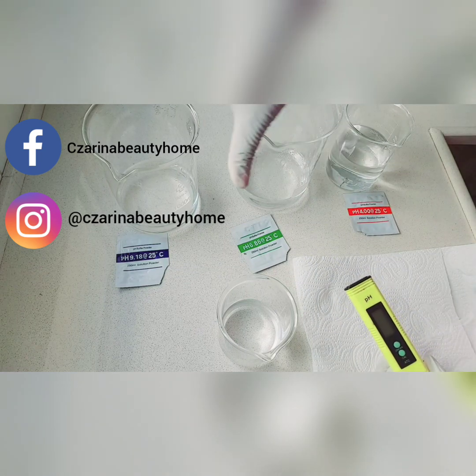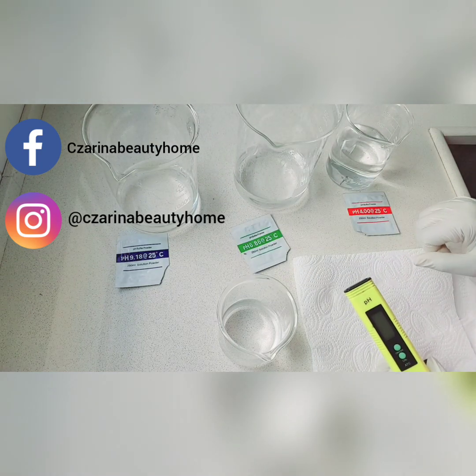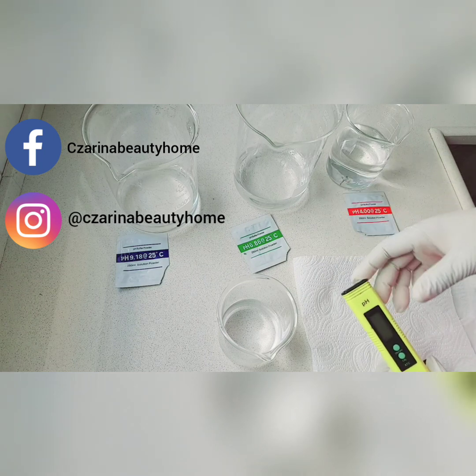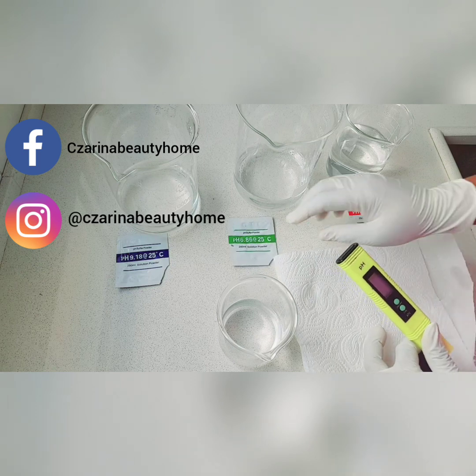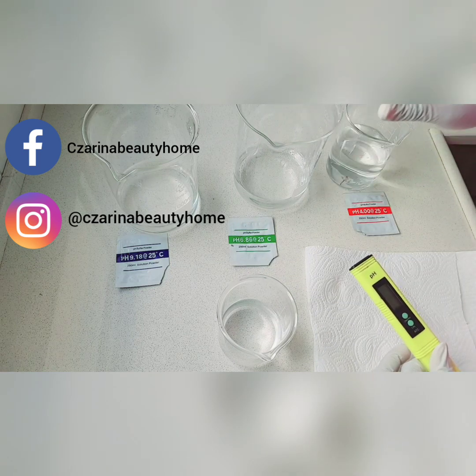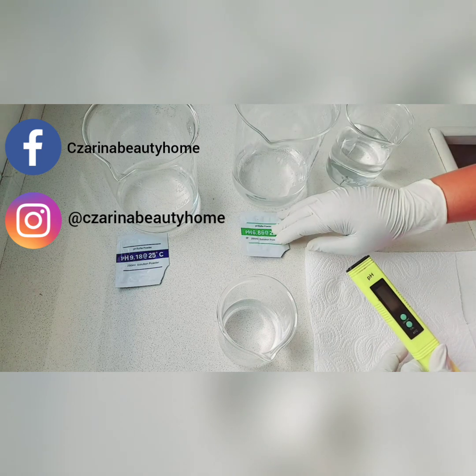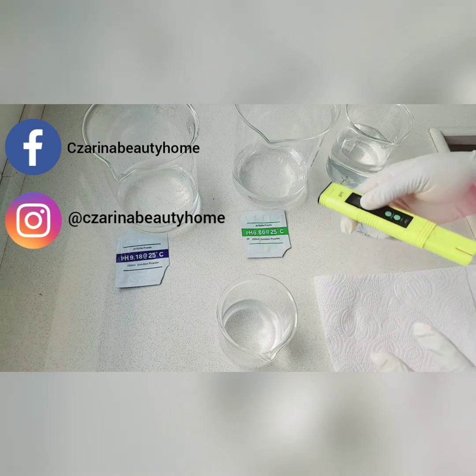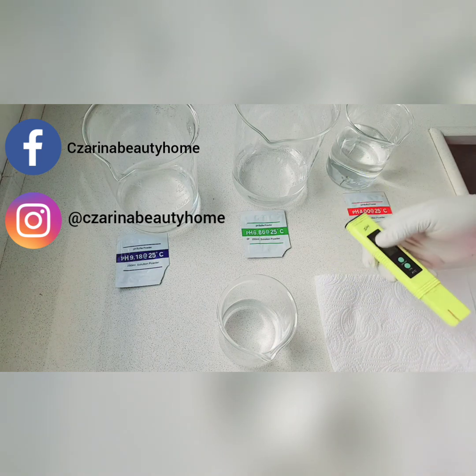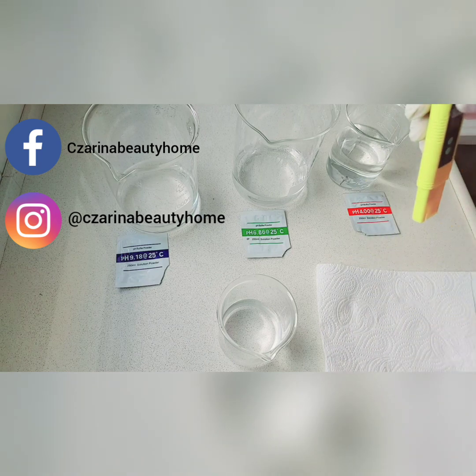I have three buffer solutions here, and you'll be needing 250 ml each for the buffer powders. You need 250 ml — don't go below that. I know some of you will say, 'How can I waste 750 ml just to calibrate the pH meter?' You need it. That's why you're a formulator, and that's why natural and organic is expensive. So you need to get 250 ml and pour in your powders, making sure they dissolve.